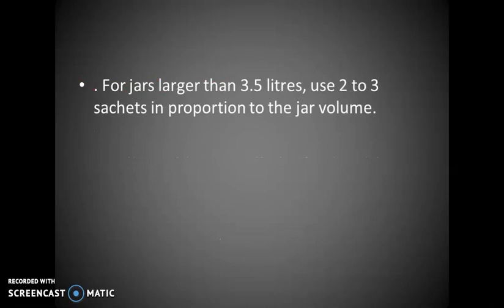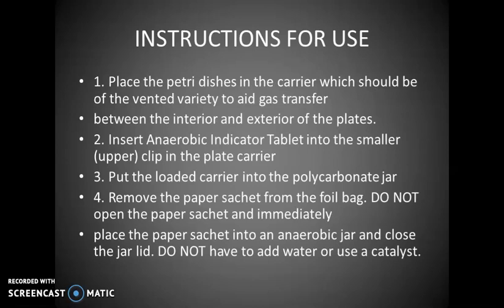For jars larger than 3.5 liters, use 2 or 3 sachets in proportion to the jar volume.